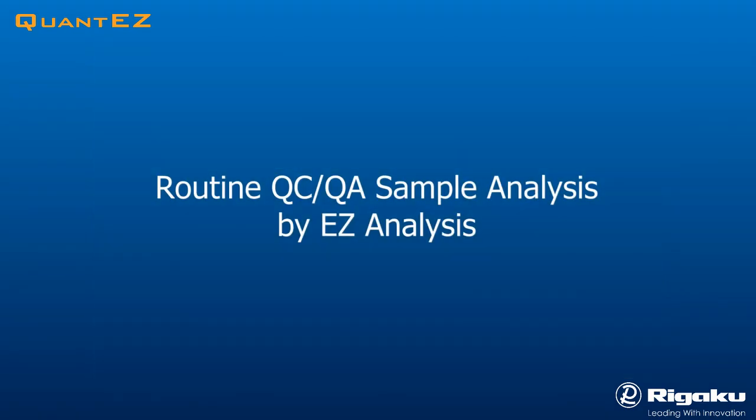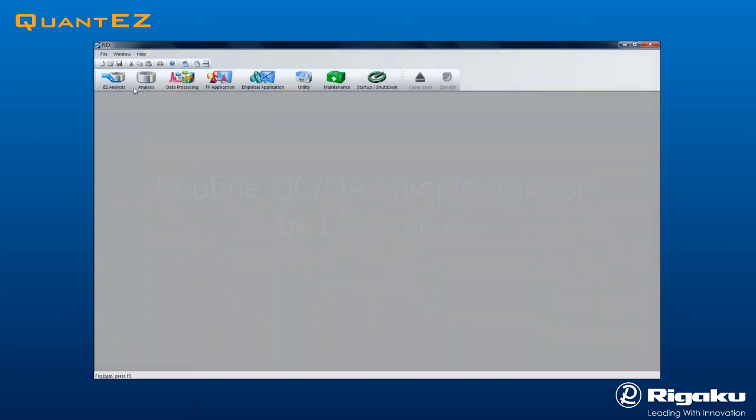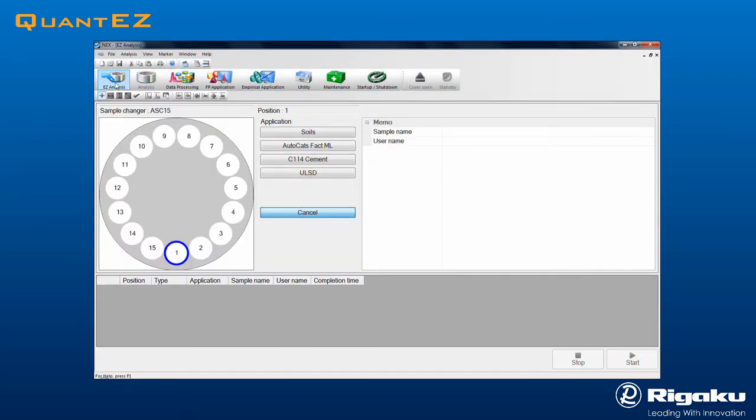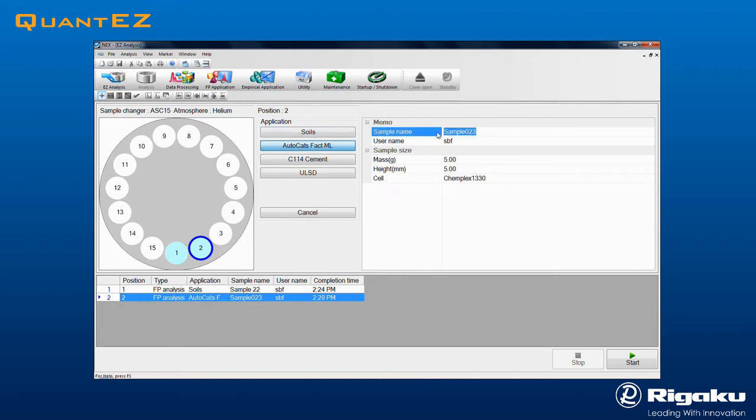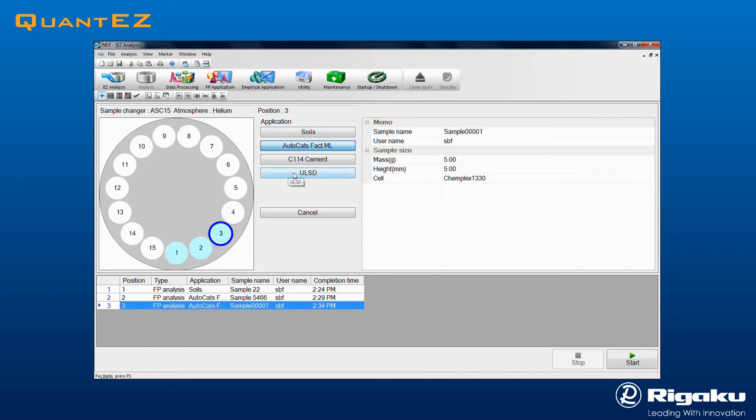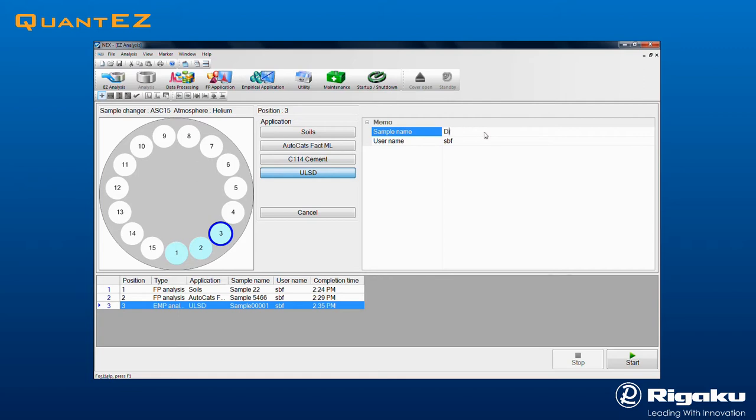For routine process control measurements, select the Easy Analysis icon. This method is recommended for non-technical users. The screen shows a pictogram of the Auto Sampler and up to six applications. An operator selects the sample position and the application to use, followed by entering a sample name and perhaps a user name. Additional samples may likewise be added. A job table is automatically generated, along with estimated completion times. Click Start to begin data collection.